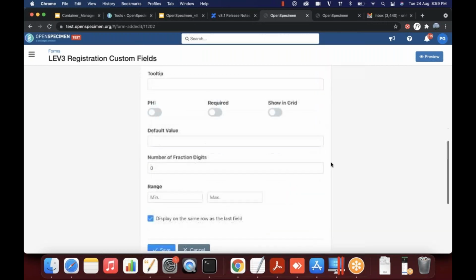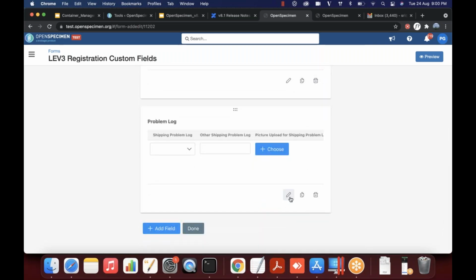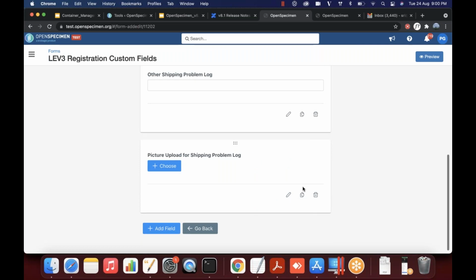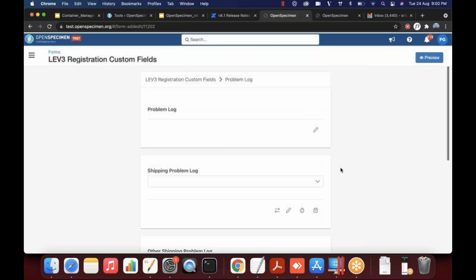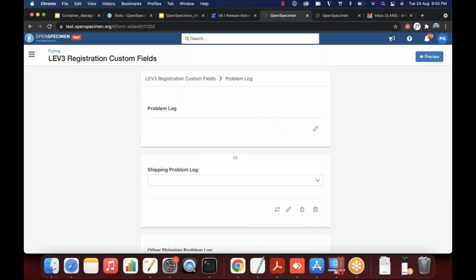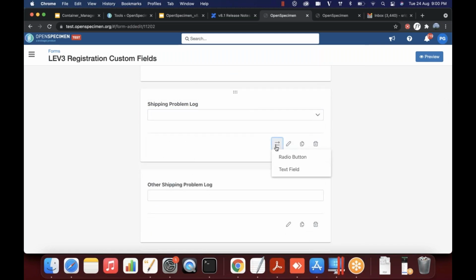There is an option to edit the field. So you can also now edit the fields. Here you see this is a single select drop down. So now the editing obviously is limited based on the field. For example, you can't take a string field and change it to a number field, right? So it depends on which field type you are editing.